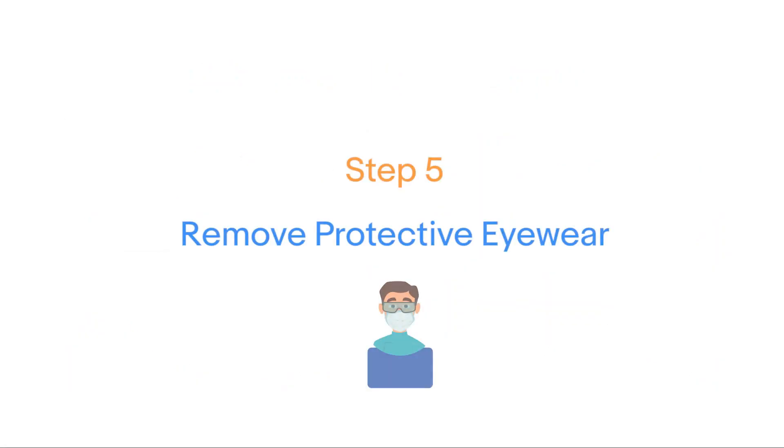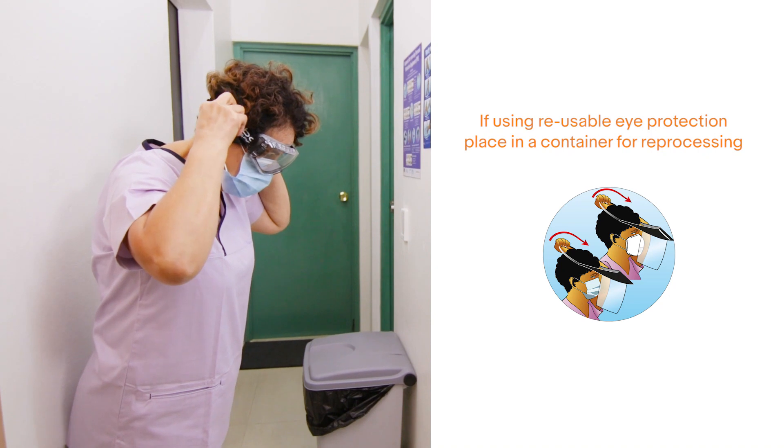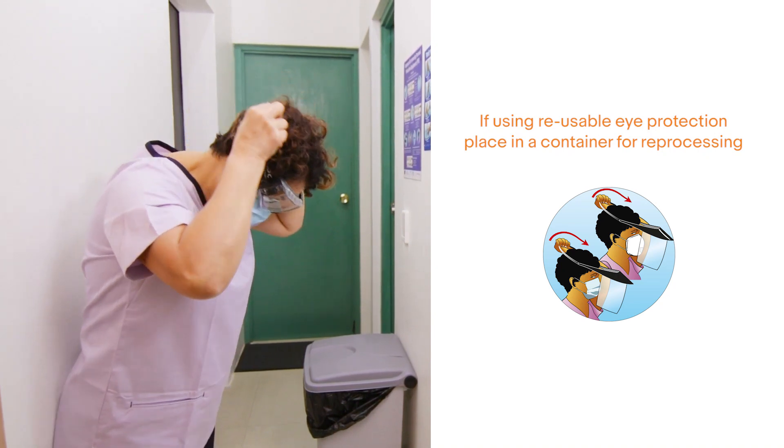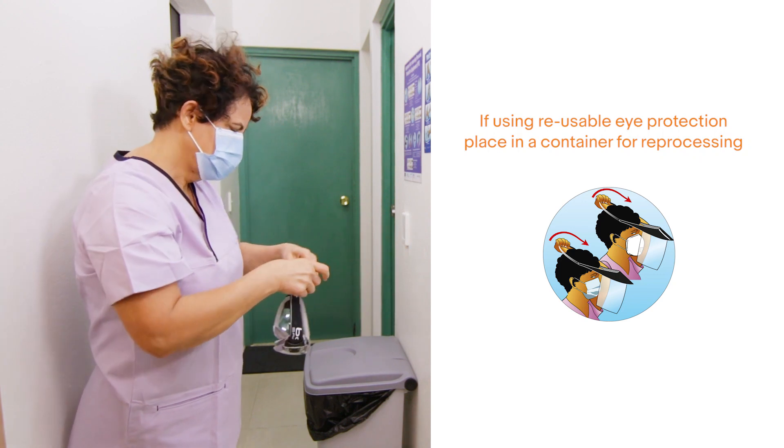Step 5: Remove protective eyewear. Do not touch the front of the face shield. Remove eye protection from behind the head and place in a container for reprocessing.